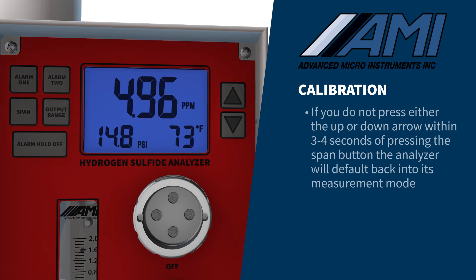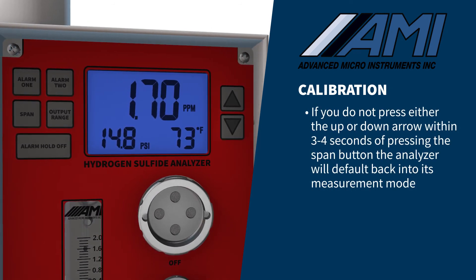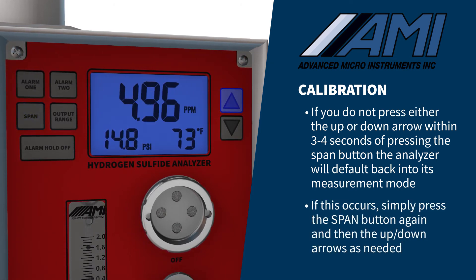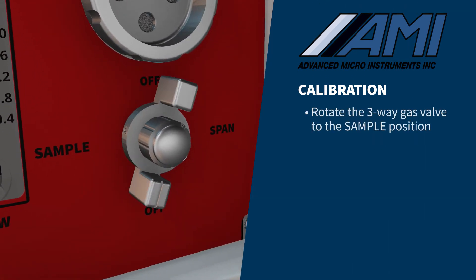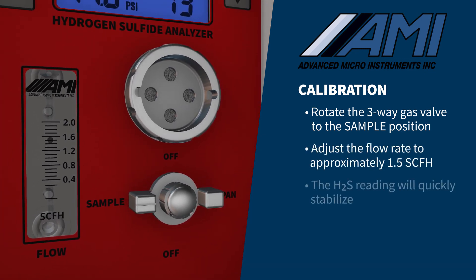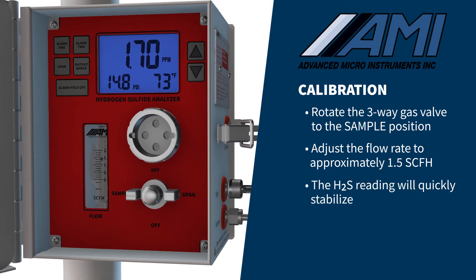If you do not press either the up or down arrow within three to four seconds of pressing the span button, the analyzer will default back into its measurement mode. If this occurs, simply press the span button again and then the up or down arrows as needed. Your calibration is now complete. Rotate the three-way gas valve to the sample position and adjust the flow rate to approximately 1.5 SCFH. The H2S reading will quickly stabilize to the H2S value in the pipeline.